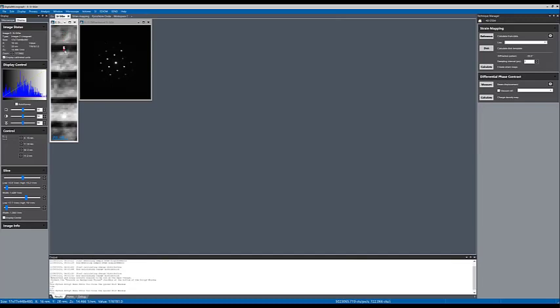As I move up and down, you can see that the diffraction pattern is breathing as I go over the layers with germanium. I hope you can see that with the refresh rate in Zoom, but that is basically telling me that the reflections are moving farther and closer, so there is some measurable strain. So let's see if we can find that.